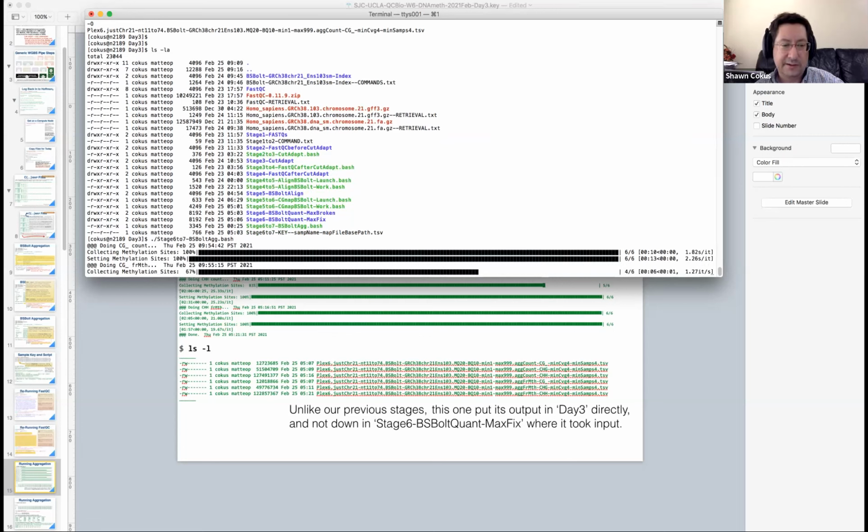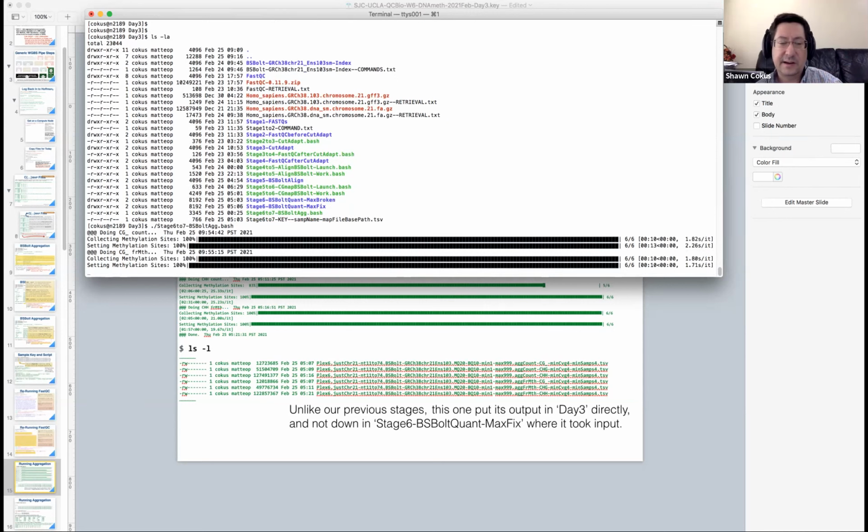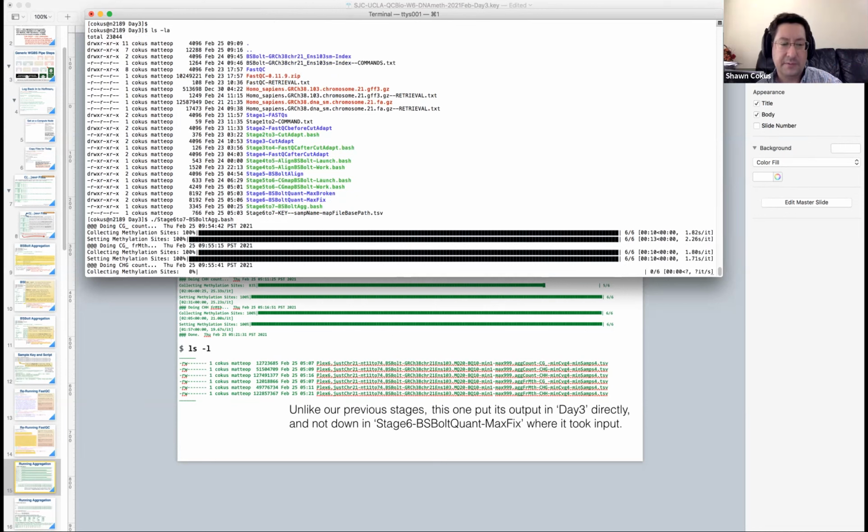We've got the methylation fraction version, the count version, and the uncount version, right? So there's the methylation fraction version, and then the 1 column per sample output, the 2 column per sample output. So 2 flavors, 3 contexts. We're running it 6 times. I'm sorry, there's 2 runs done there because it seems to have 2 stages for each run.